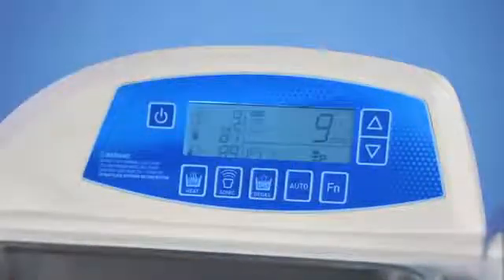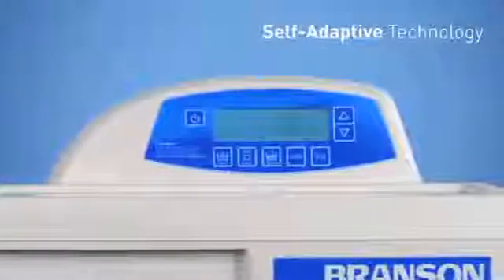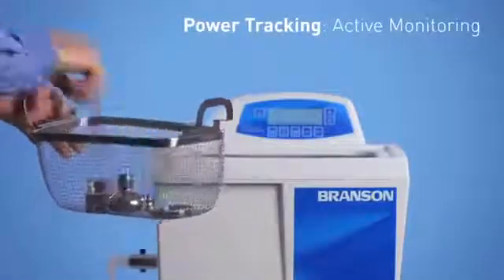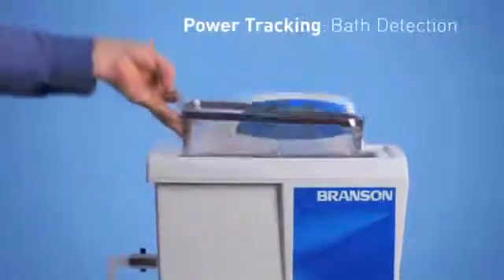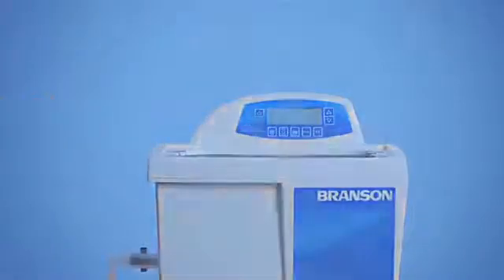For even easier operation, the Bransonic Digital bath can also run in manual mode for push-and-go operation. With our new and innovative self-adaptive technology, you'll get unwavering cavitation and calibration when load conditions change. The self-adaptive uses ultrasonic power tracking to actively monitor the bath load and detect the adding or removal of items. Once a small change is sensed, the power tracking circuitry technology will bring the operating frequency back to its optimum levels.